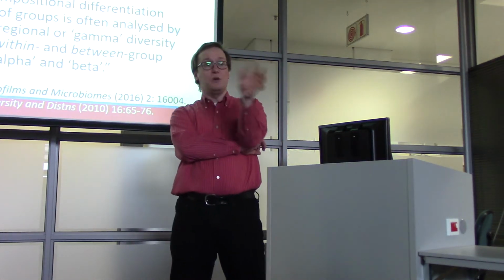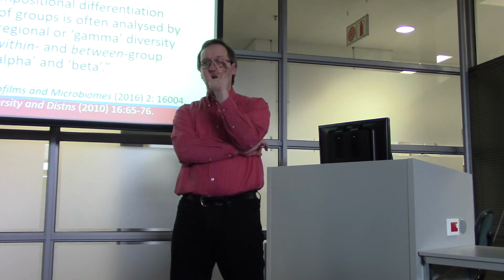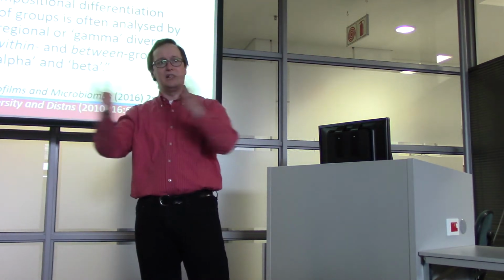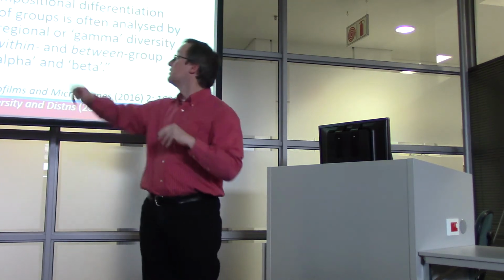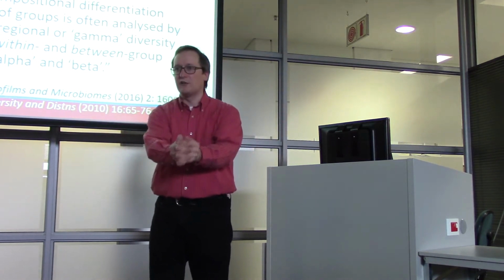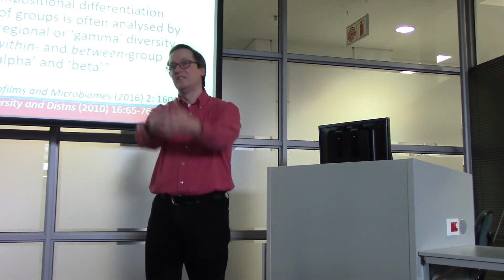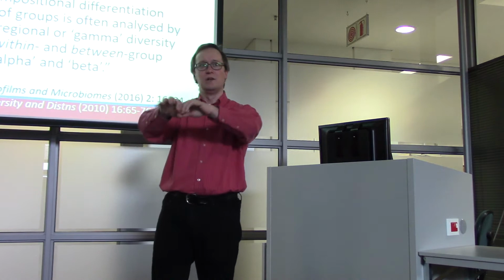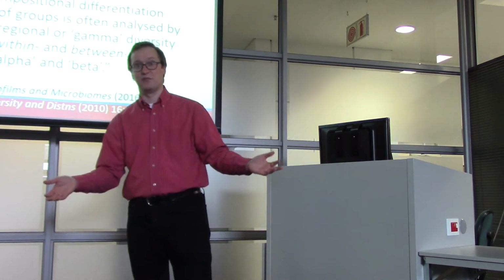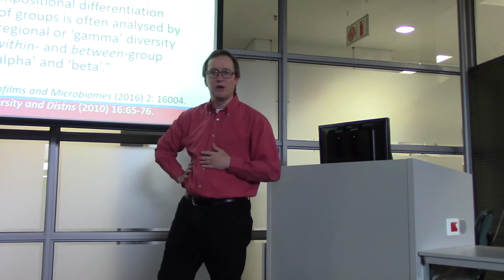Okay, so having sequenced a whole bunch of reads from the 16S region, we look for the most common sequences that we have here, and we ask if we can cluster similar sequences together. So we use this rather arbitrary criterion of 97% similarity to drag these together and say, well, I know that there's a little bit of sequence walkabout among these, but we're going to assert that these all come from one species, and the sequence variation that we see among them is just normal variation, or sequencing errors for that matter. Okay, so an OTU says we have this particular bug present.